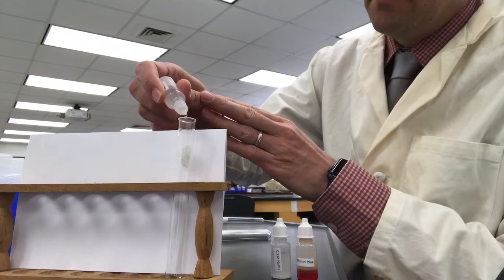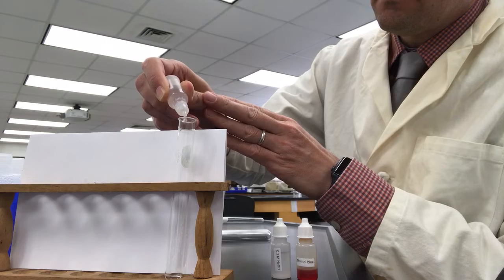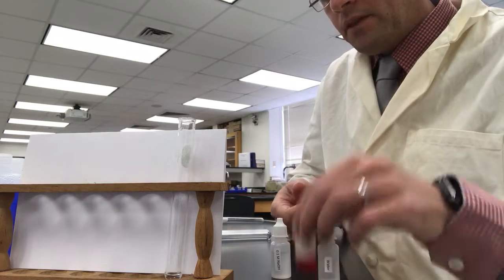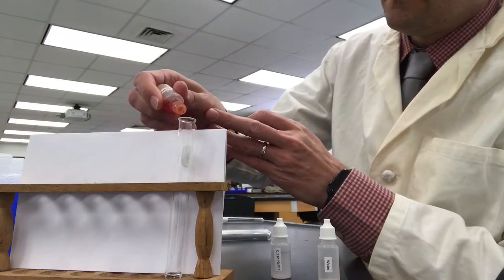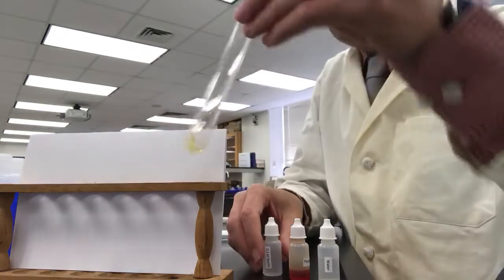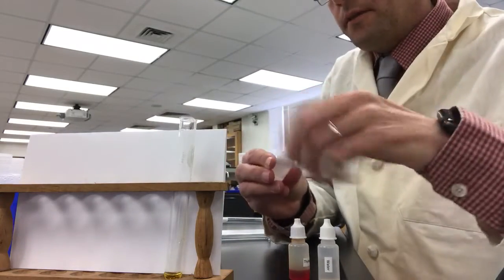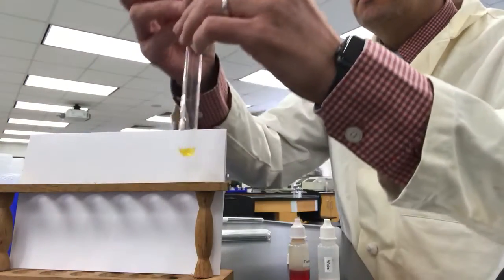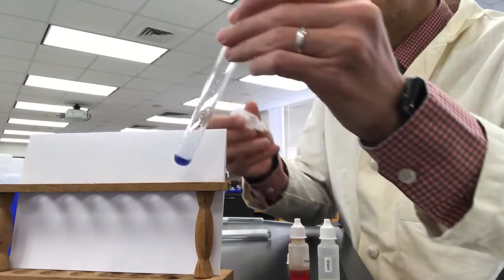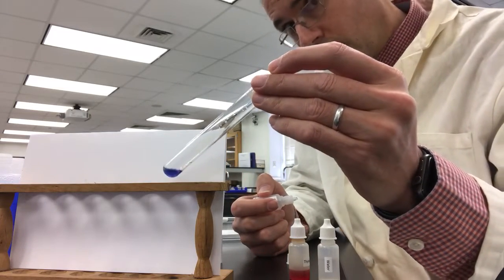So here's water. Here's thymol blue — and that's the starting color. We'll add a single drop of sodium hydroxide to this, and that's the color there. Now you know why thymol blue is called thymol blue.